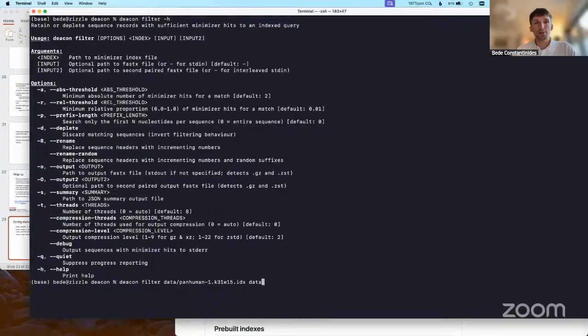Here I've got some reads, which are simulated reads of viral RefSeq: simulated 10x coverage genomes for 17,900 viral genomes. Hopefully, if we do host depletion, we don't lose too many of these reads, because these are microbial and we want to keep them. This is a FASTQ file compressed with Zstandard, which is supported natively as well as gzip.